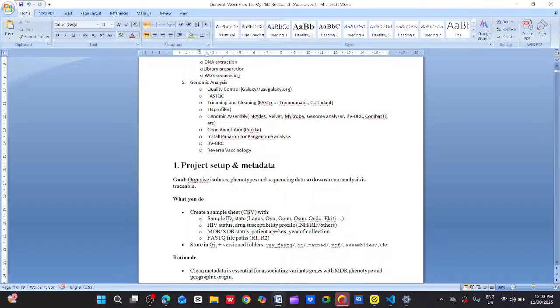Each of these categories of annotated protein will serve a different purpose. Some of them will serve the purpose of whenever we want to determine the virulence. We will be able to know that, and those that will be for vaccine design, we also know that. We also look at what are called the housekeeping genes. The housekeeping genes are too essential. For example, in cell wall analysis, metabolic proteins, replication, the ones that are too essential are called the housekeeping genes.